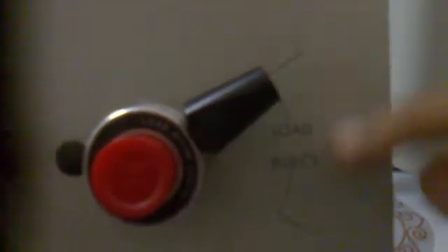Inside the electrochemical detector there is a column. This is the Rheodyne injector. As you can see, it has two positions: one is the load position, as you can see written here, and the other is the inject position.